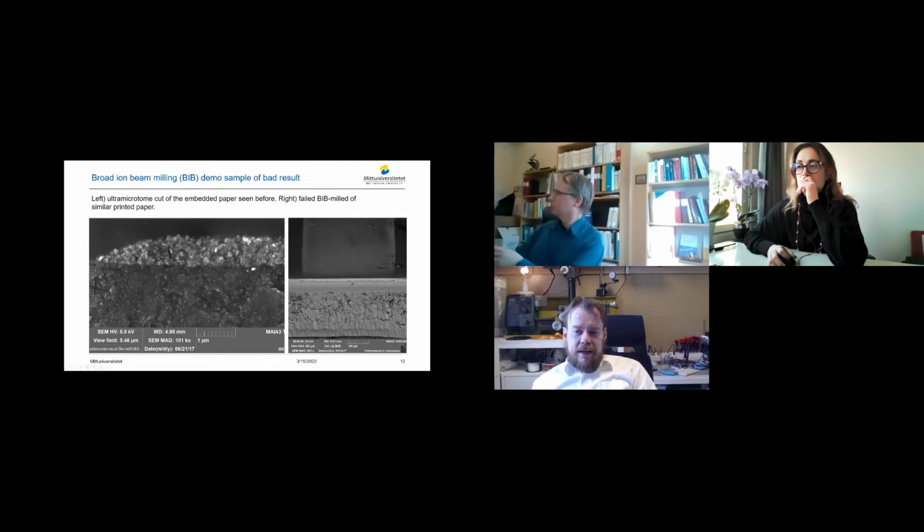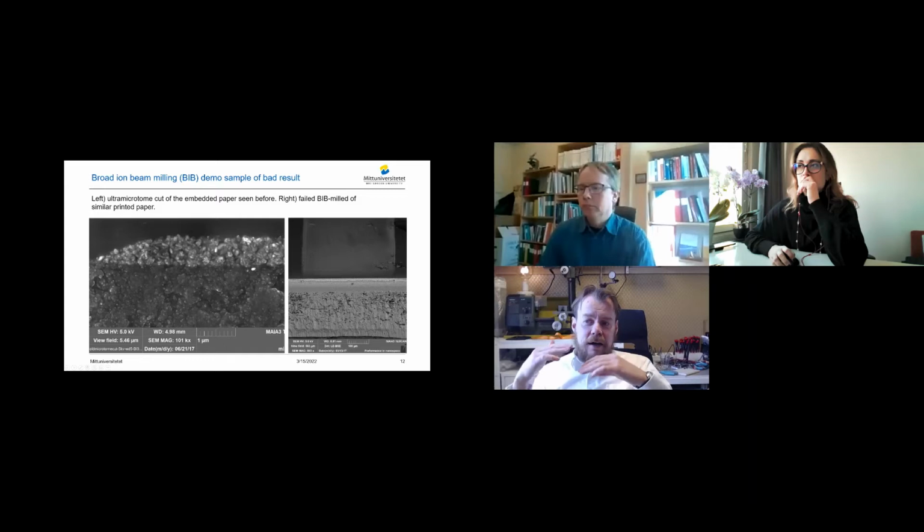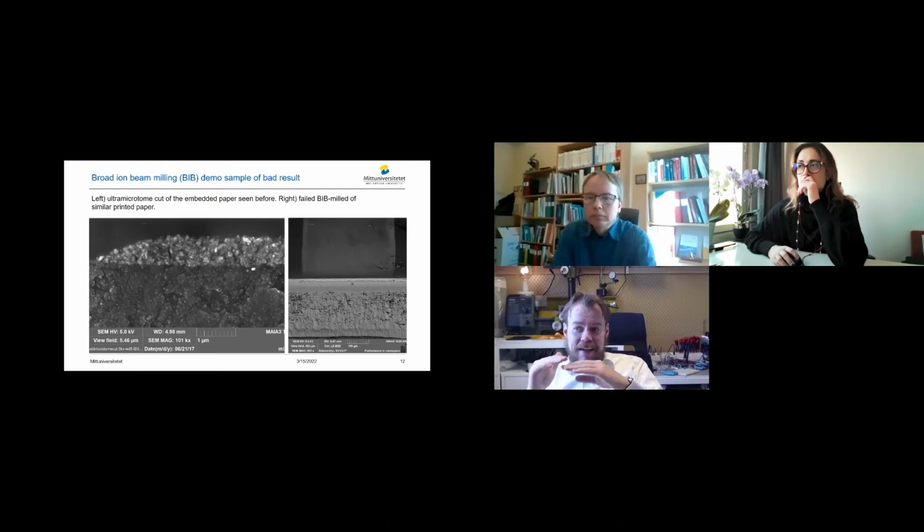And we can see that these inkjet papers are very complex papers. Actually, it is a layered material of ceramic compounds and soft plastics and things like that. And then we have these very heat sensitive silver nanoparticles. If you heat them up above 100 degrees, they start to sinter. So what I actually want to show you with this picture is that this is an awful result.